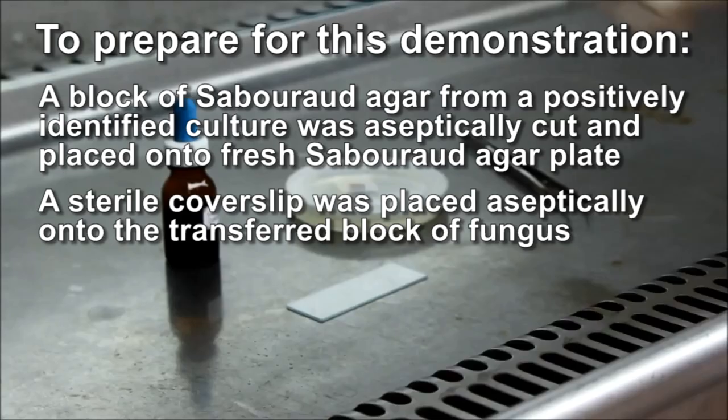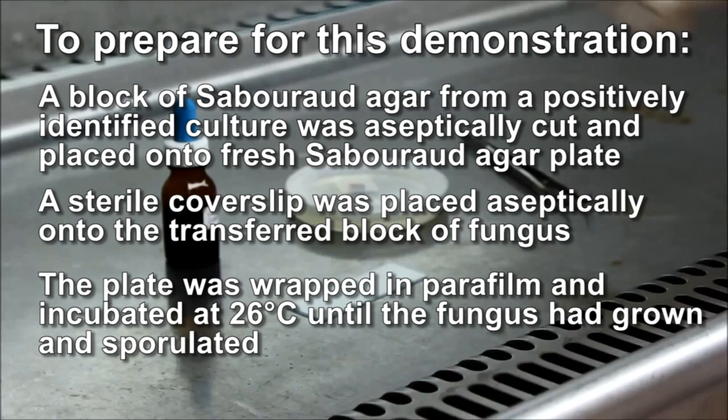Mycelia and spores attach to this coverslip as the culture grows. The plate was wrapped in parafilm and incubated at 26 degrees until the fungus had grown and sporulated.